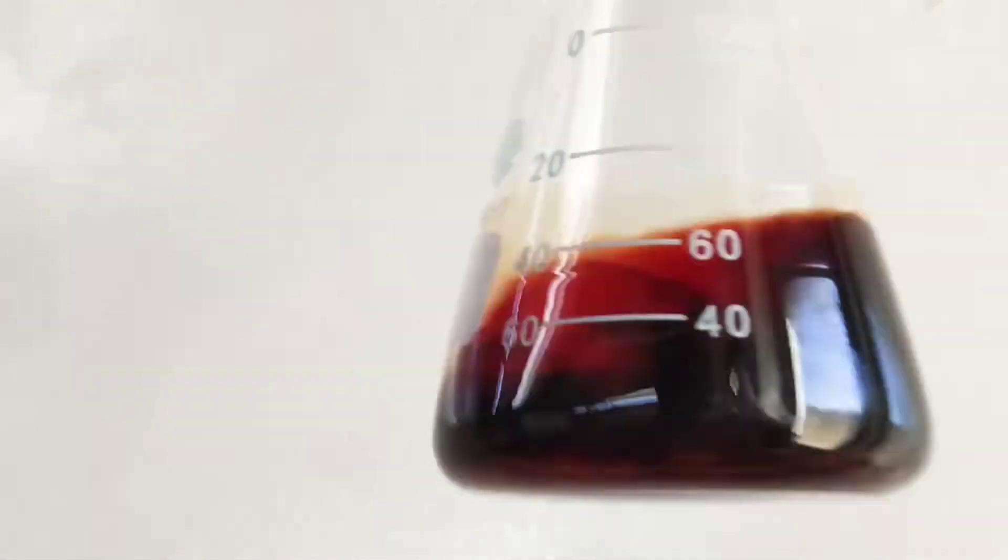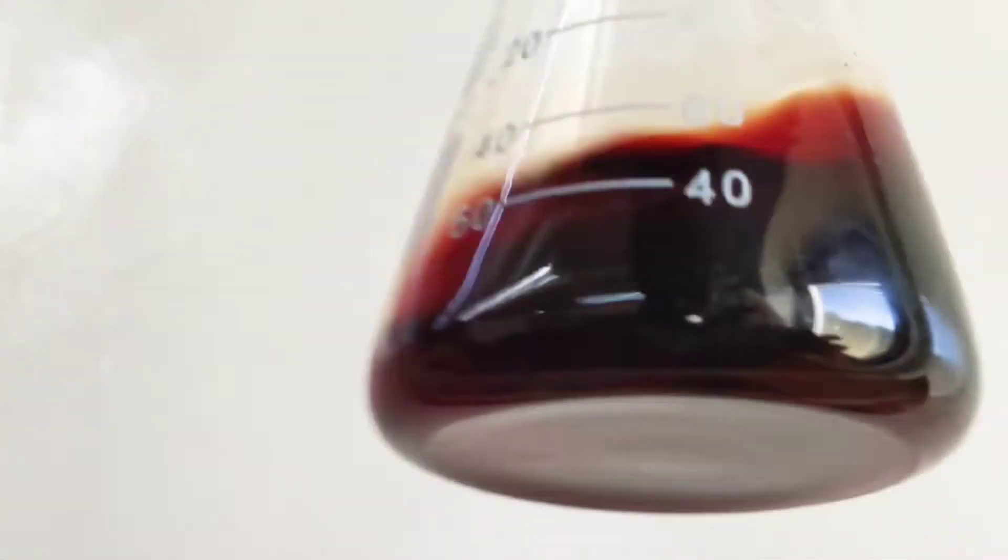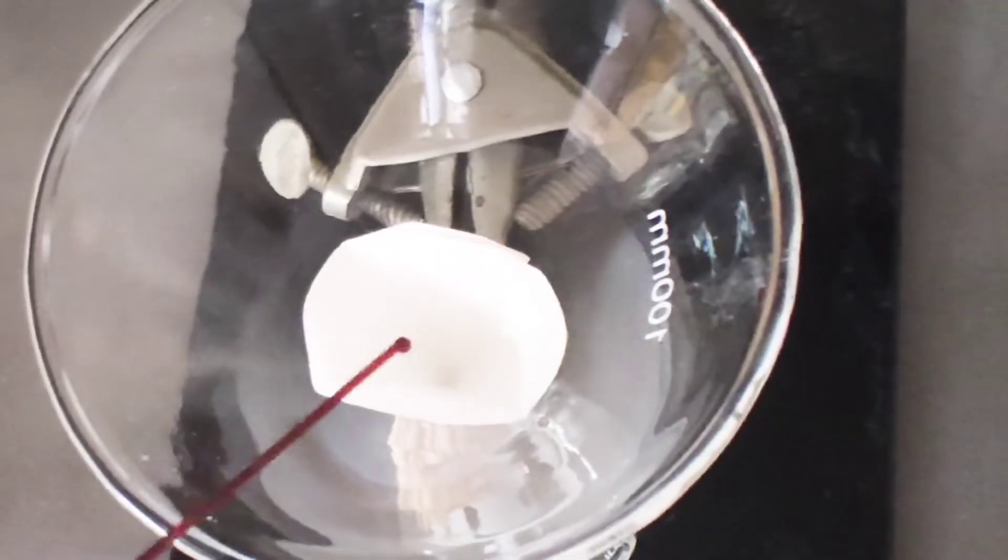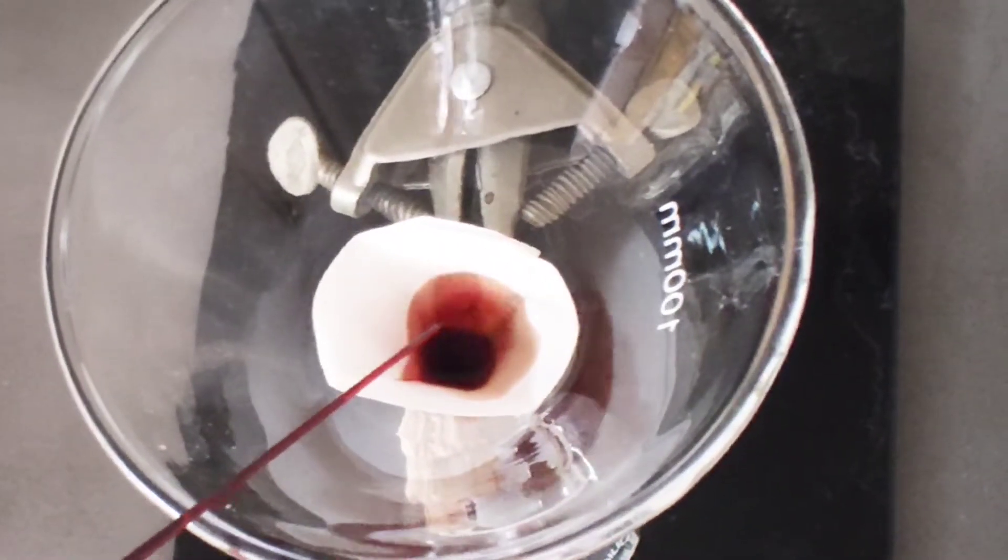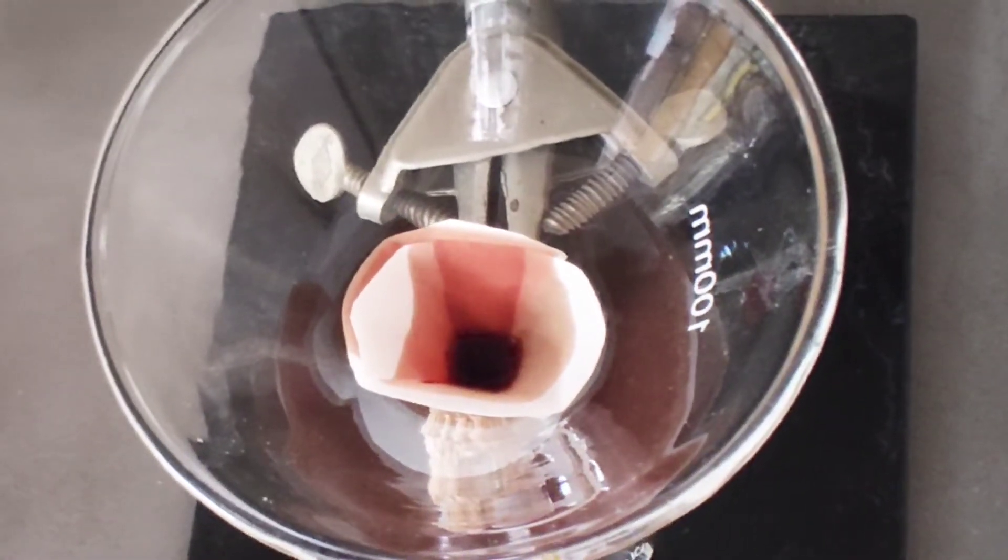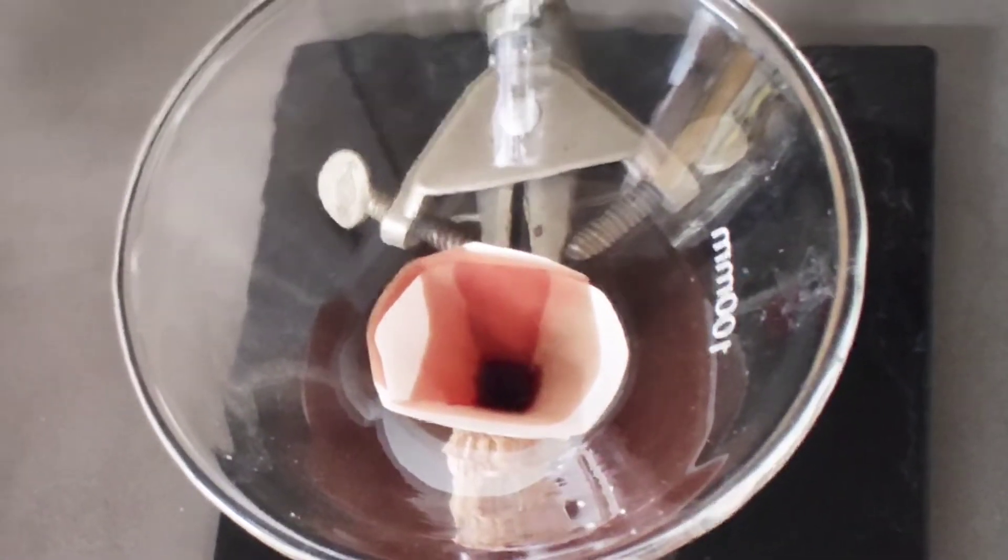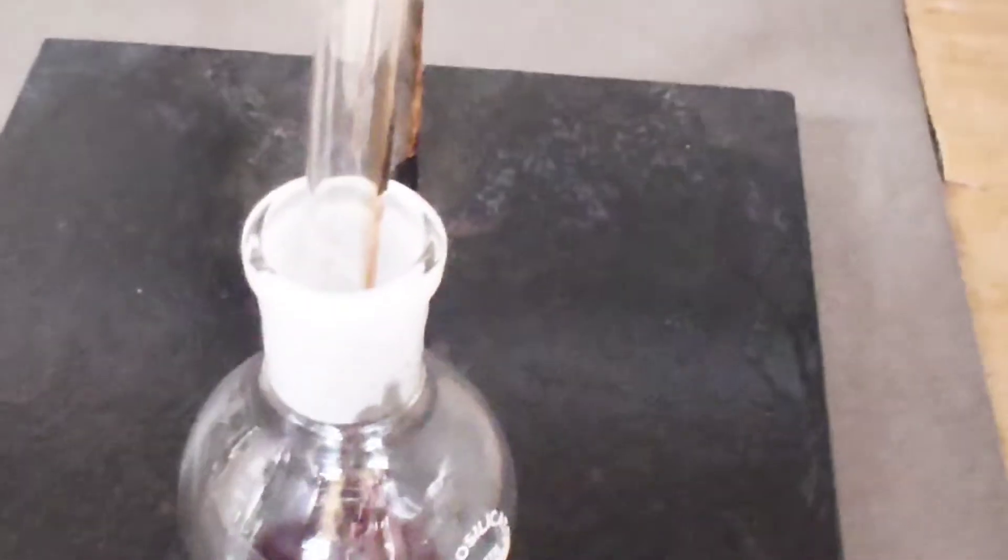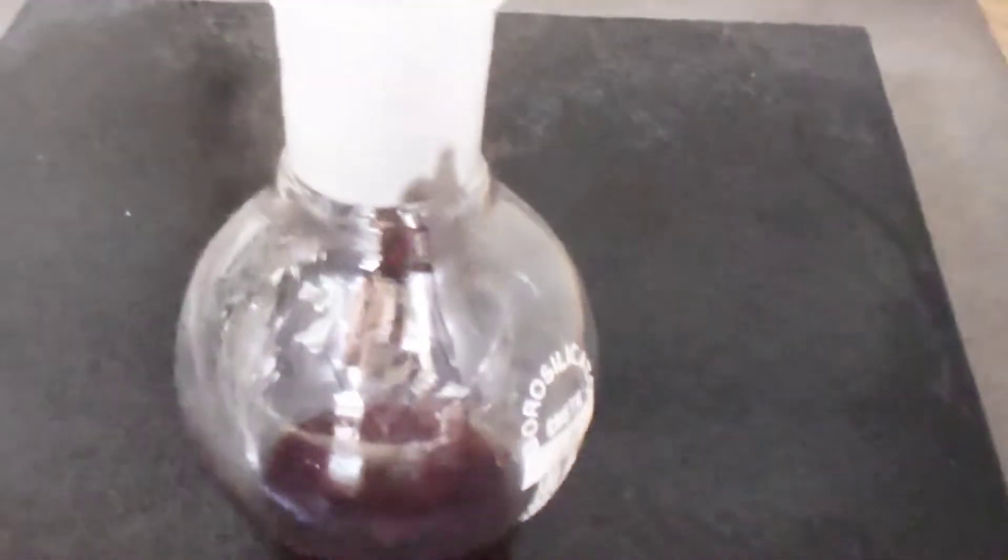After a few minutes we filter the solution in order to get a DCM solution of the cobalt corrole dry that we are going to then evaporate and start to recrystallize. We collect the red-brown filtrate in a round bottom flask.